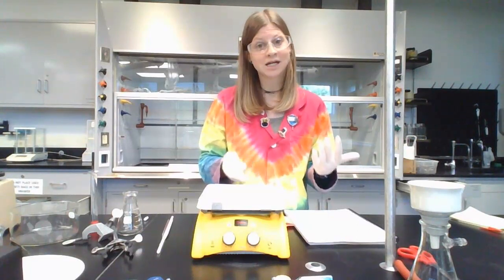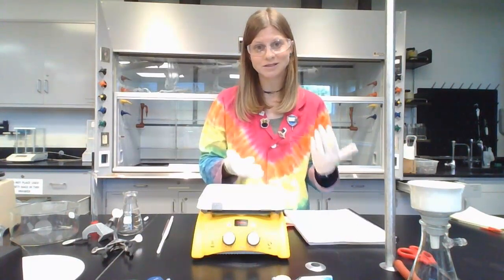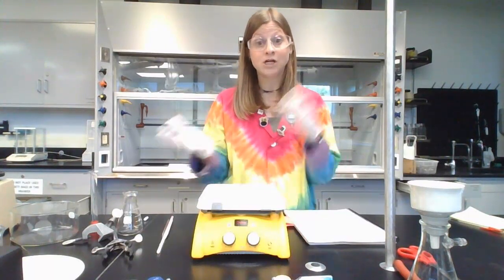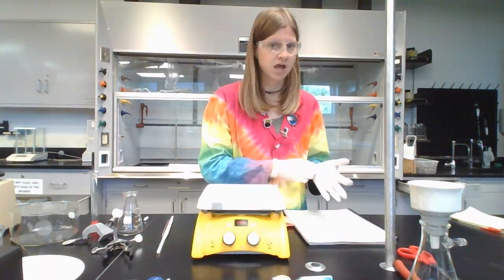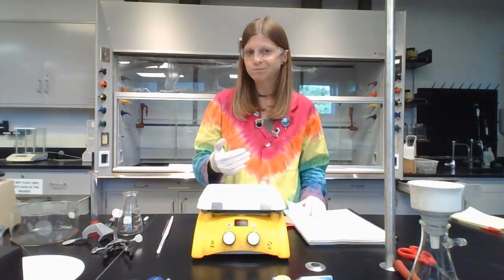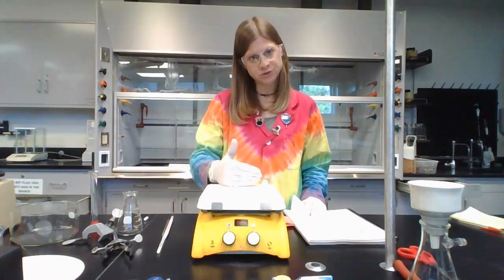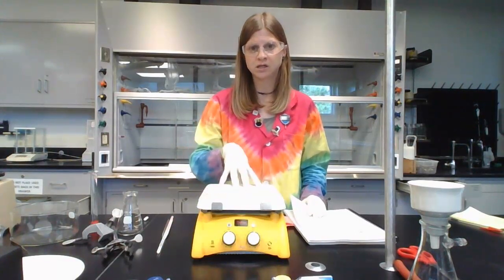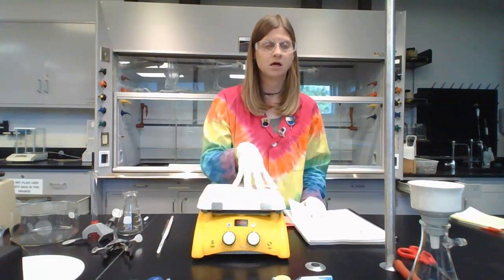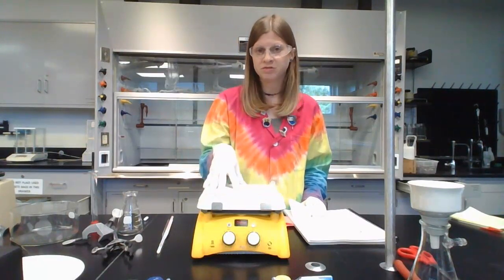The kinetics of these reactions are not always very quick, which means these reactions are slow. So while you're waiting for one thing to happen, you need to be working on the next thing. The way this lab was written was more in the order in which you need to do it, not so much broken into the 3 separate things that we're doing: making aspirin, doing the phenol test, and then doing the TLC.